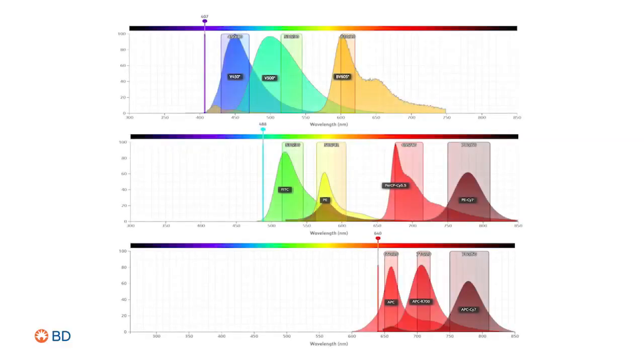Here you can see a 10 fluorochrome panel on a 10 color cell analyzer. In this case, there is significant spectral overlap between multiple fluorochromes.